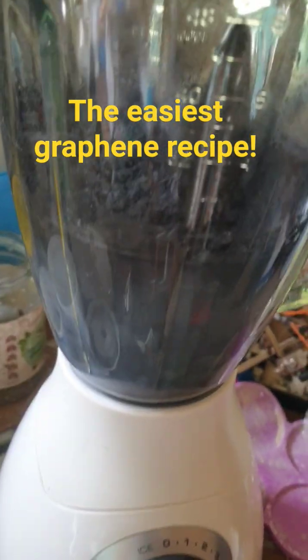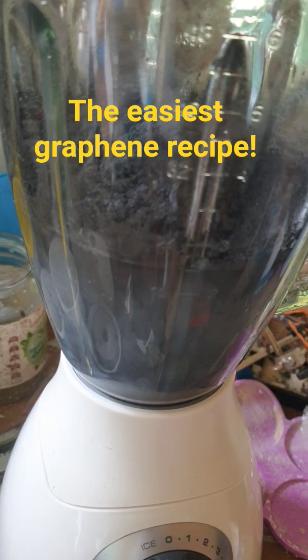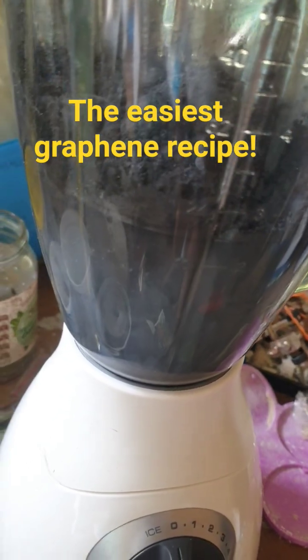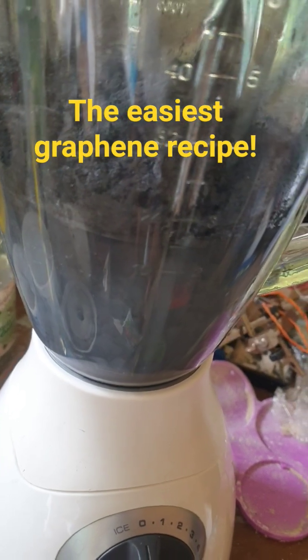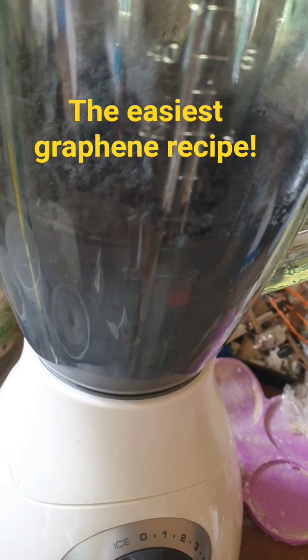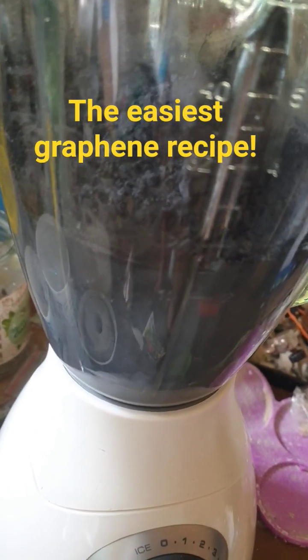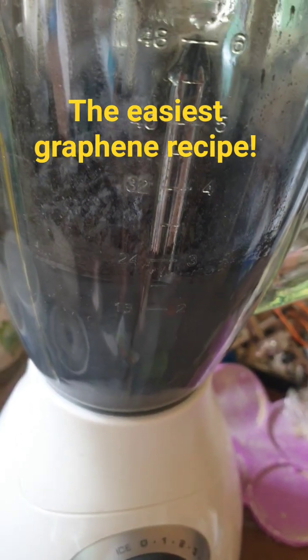What we've got here is graphite in 500 mils of distilled water with 2 grams of whey protein, which is a milk protein. The goal here is to make some graphene using a method outlined by Robert Murray Smith. It also references a kitchen chemistry paper where they did this same method to make one of the cheapest and easiest ways to form graphene.